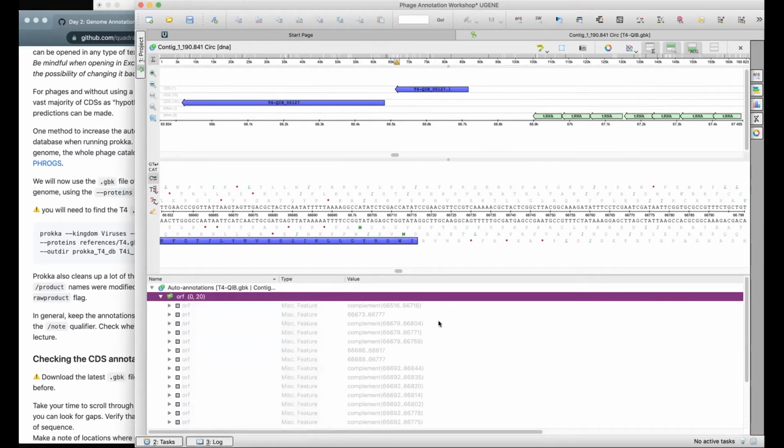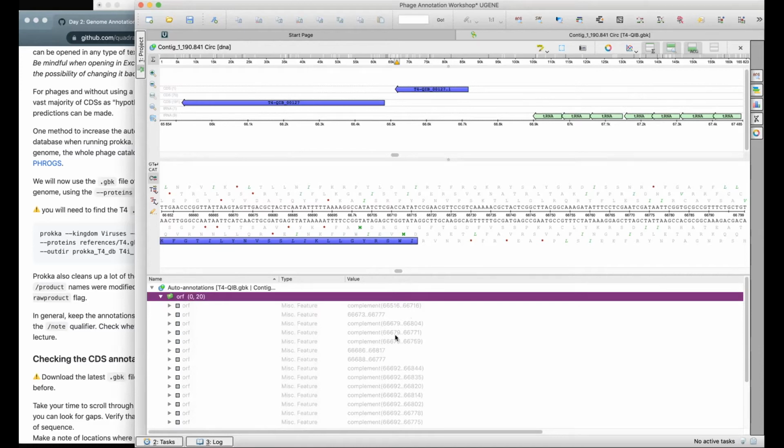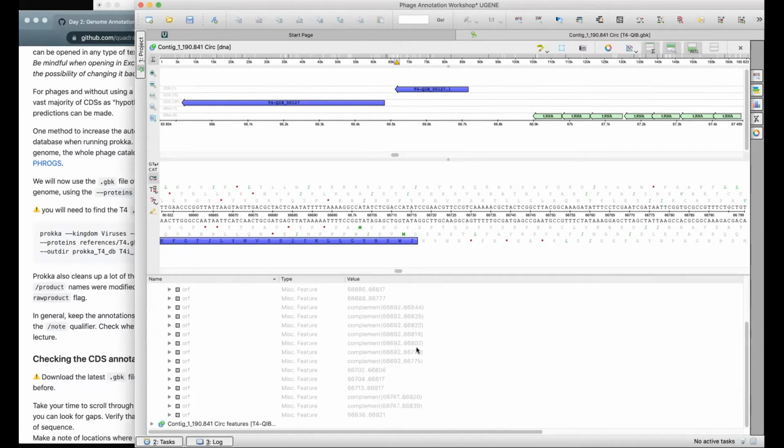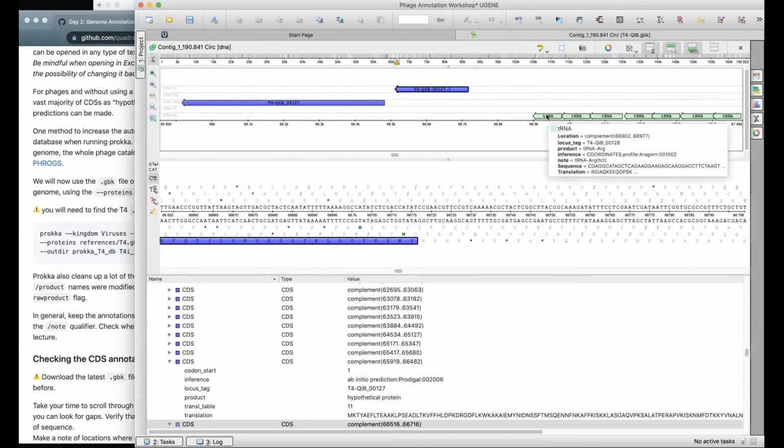You can see here, like Andrew showed in the codon stuff that he had in his presentation, that you can see the coordinates here. All of the ones that are on the complement, there's a couple of small ones. But I think we found our potential gene here because here we're moving on to tRNAs. So I don't think there will be another one here. I think we found our extra one.